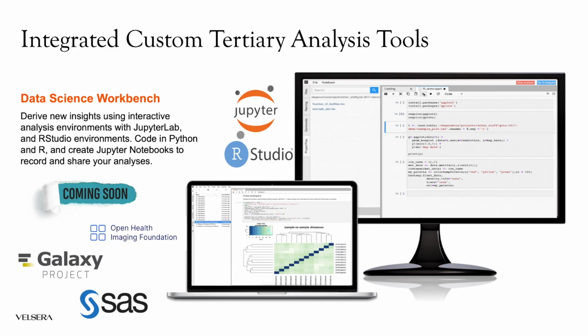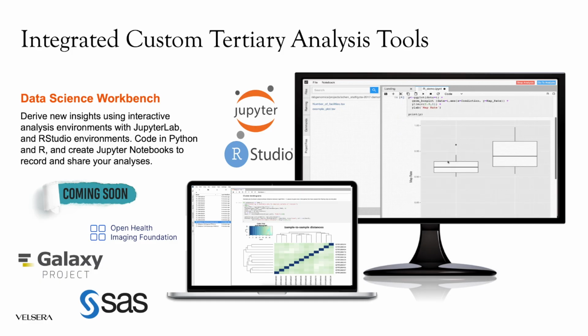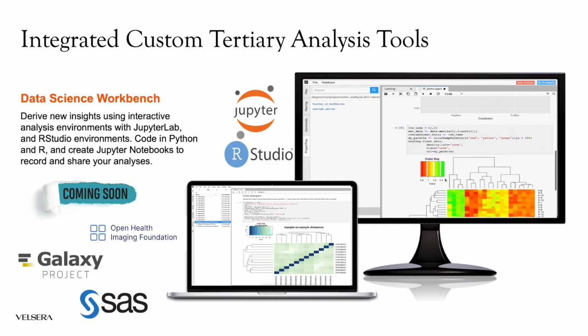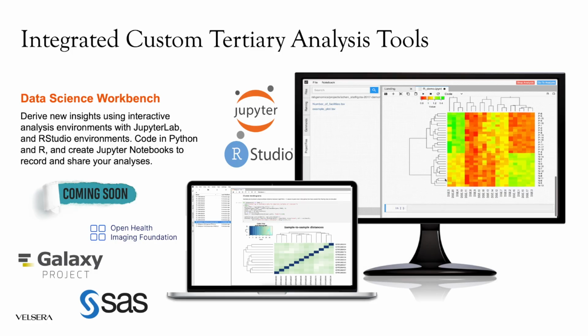As mentioned, you can perform custom tertiary analysis and visualizations directly in the cloud using our R and Python tools. Galaxy, SAS, and an imaging service are all coming soon. These work functionally the same way you're familiar with on your computer, but a lot faster on the cloud.